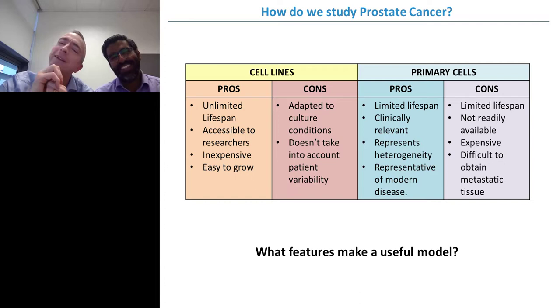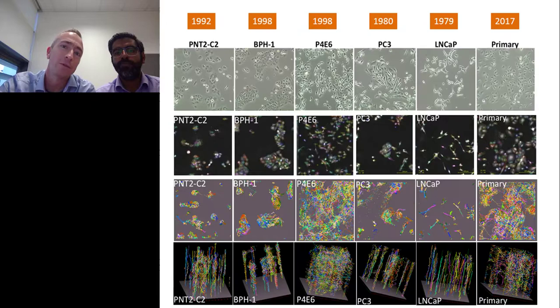Compared to using normal cell lines themselves. Obviously, immortalized cell lines are great. We can do loads of research, and they're vital for it. But primary cells can behave differently, and actually, the QPI has been really good at revealing the differences in their behaviors.